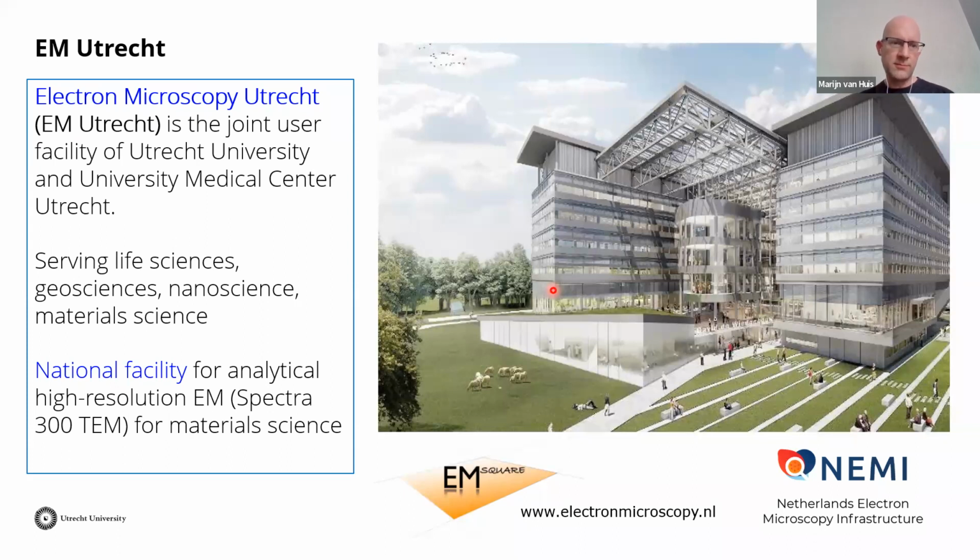Together we serve both the life sciences, so the cell biology mainly in the hospital, the biological imaging of proteins mainly at the university. But we do life sciences, geosciences, nanoscience, obviously, catalysis, material science. We take pretty much all samples. And thanks to NEMI, we are also a national facility for analytical high-resolution EM.